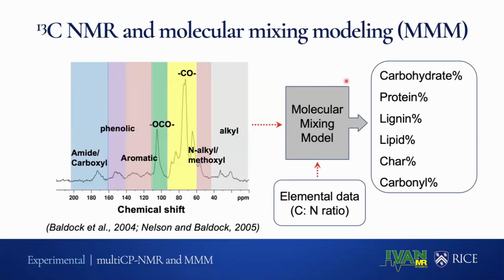Furthermore, as Marata mentioned before, we used an end-member molecular mixing model to get more quantitative information on the chemical composition of POC.